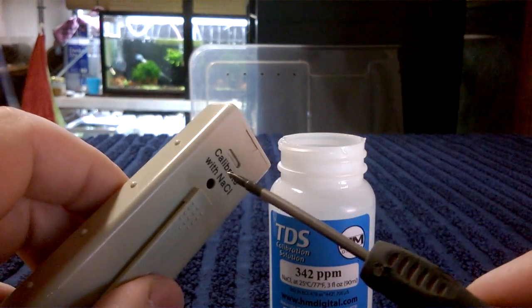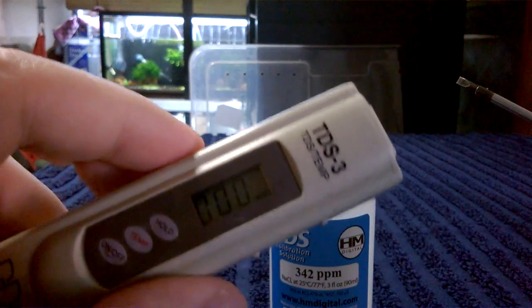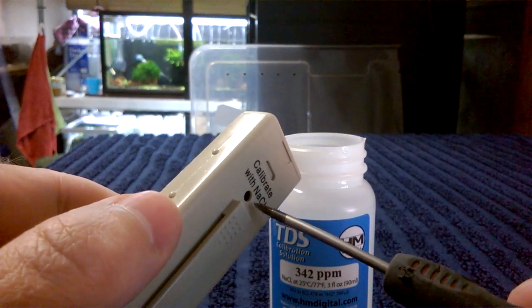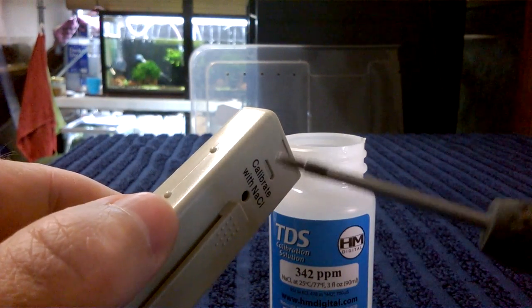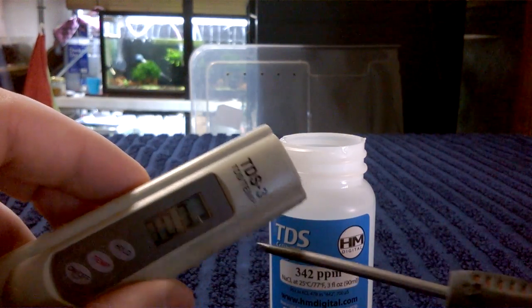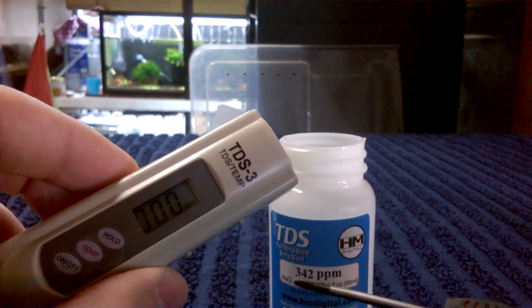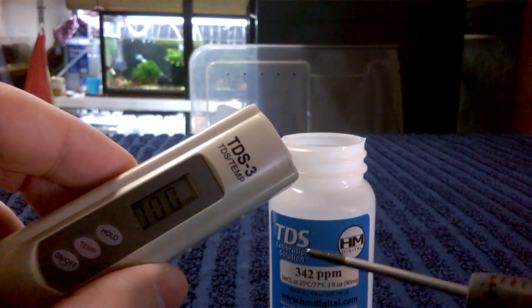If yours was off a little bit, there's a tiny screw hole on the back. You can put your screwdriver in and turn it — say you're off by one or two points, you can turn this little screw left or right and it will adjust the readout to the correct reading. Just match the readout up with the parts per million stated on your test solution bottle.